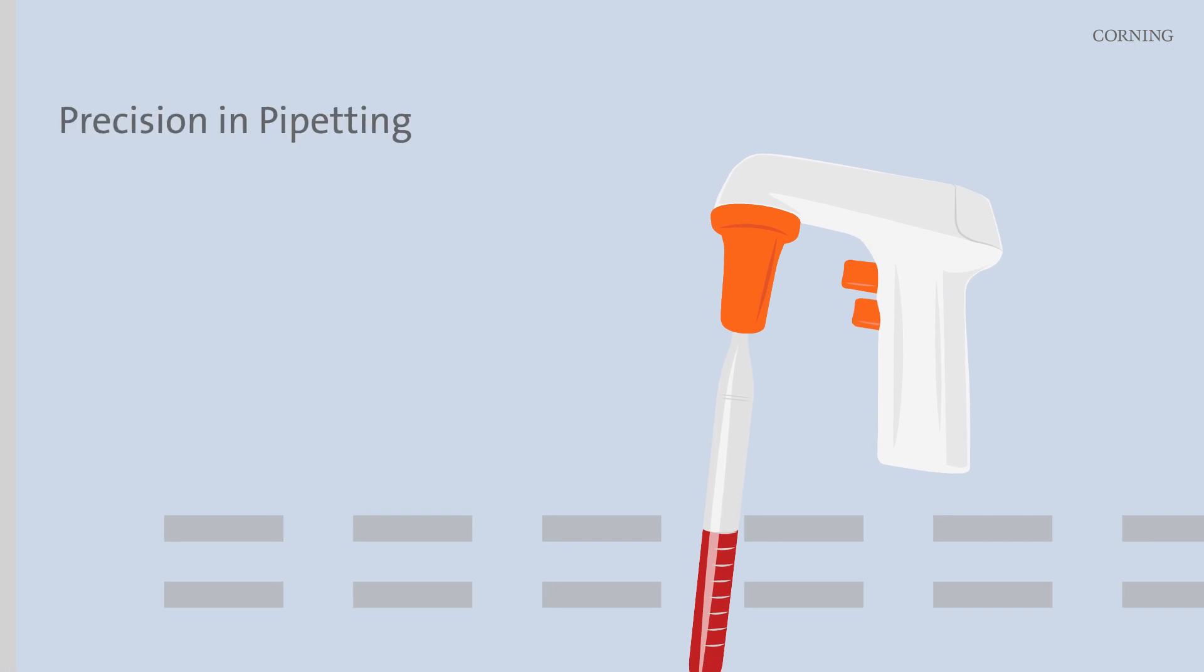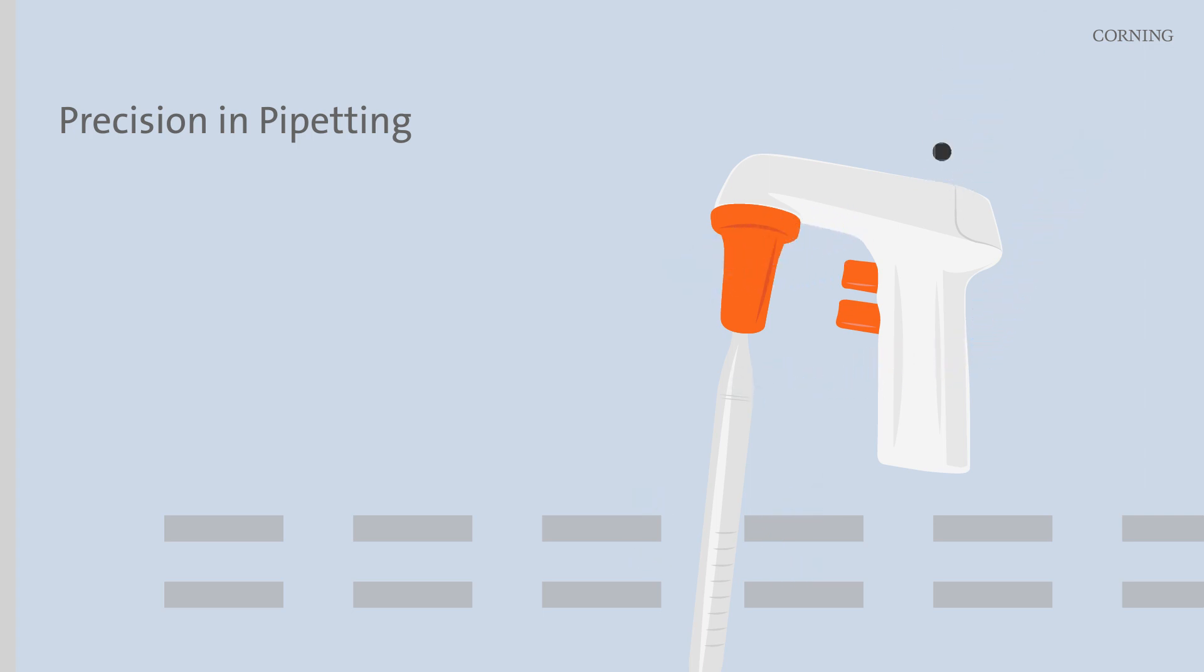Seamlessly transfer your precious cells using sterile serological pipettes and the pipette controller, ensuring accuracy and minimizing the risk of contamination.